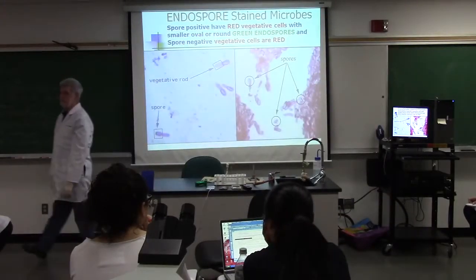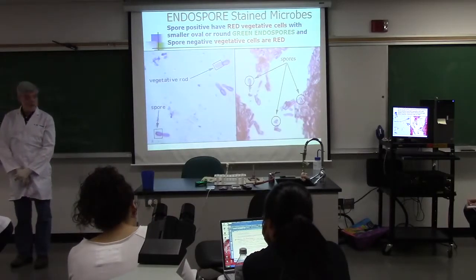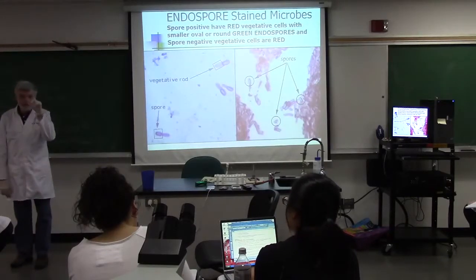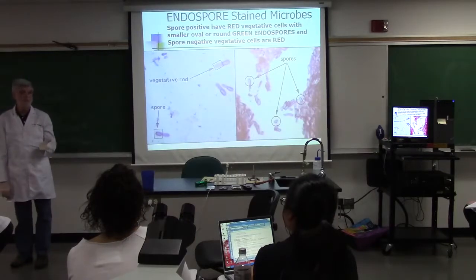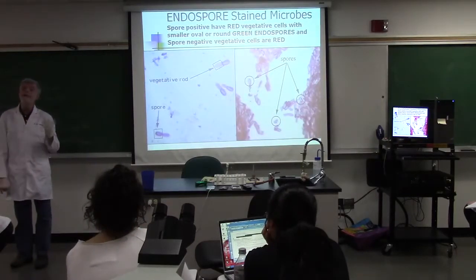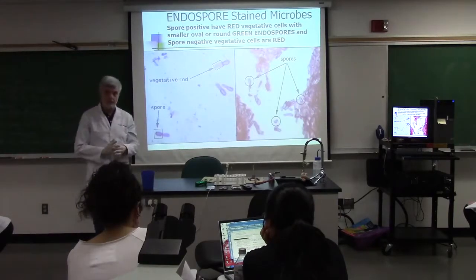All right, so here's some interesting tidbits. Any stain can be an endospore stain. You've seen endospores on every one of your stains you've been looking at. I'll say, what's that clear little pink thing there? Oh, on your Gram stain. It's an endospore. And on the acid fast, what was that clear little blue thing? Endospores. Any stain can be an endospore stain.